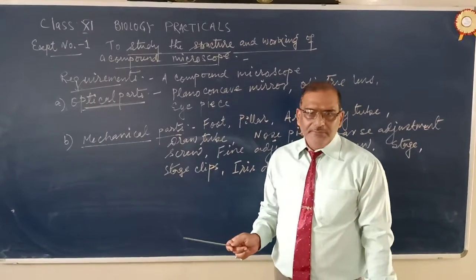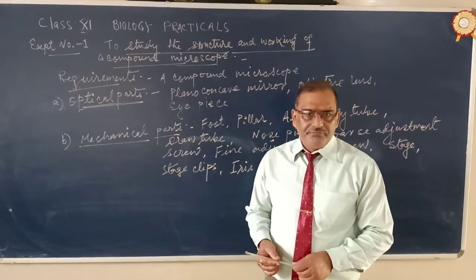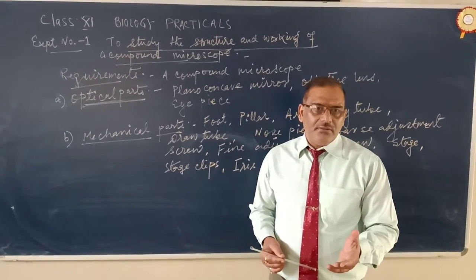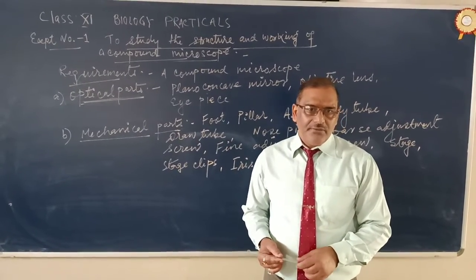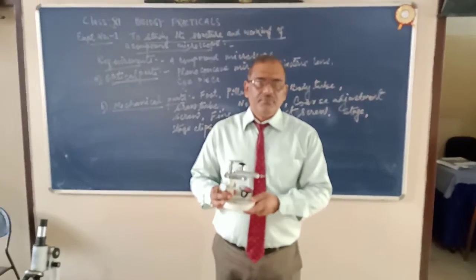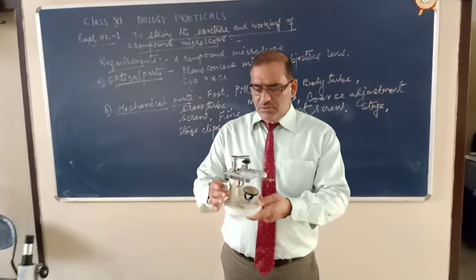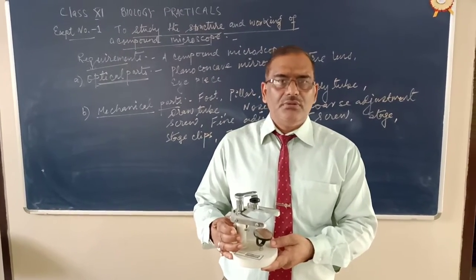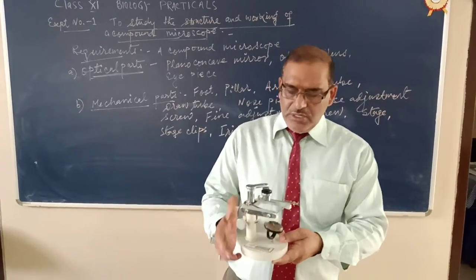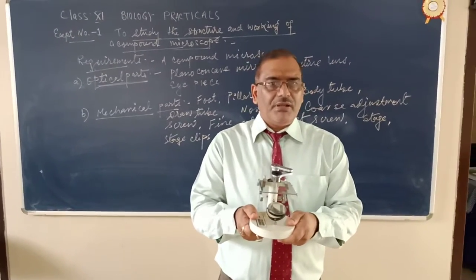Now let me show the compound microscope practically, live or working. Okay. Now, hello friends, let me first of all show the parts, structures and working of the simple microscope. Now this is the simple microscope. Okay, this one is the simple microscope.